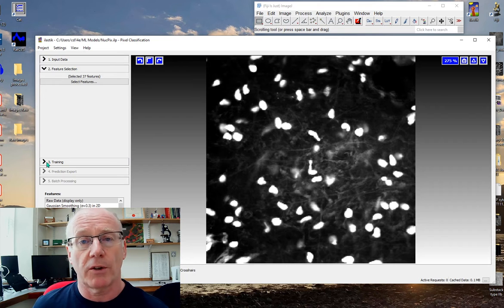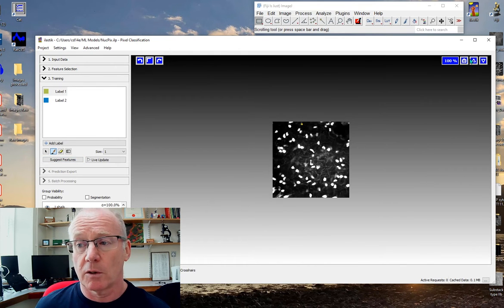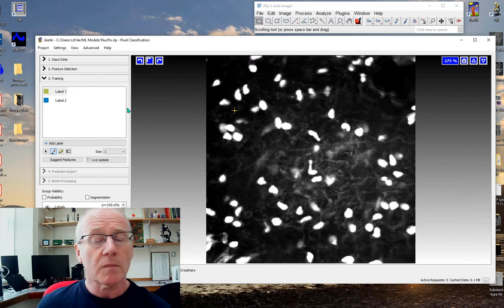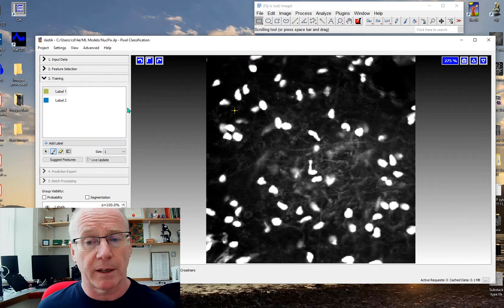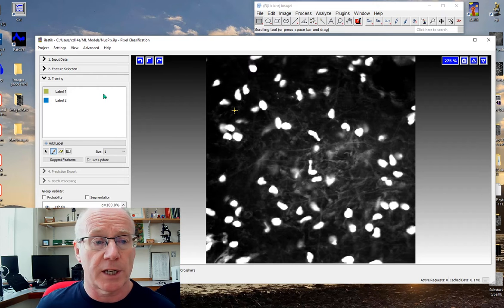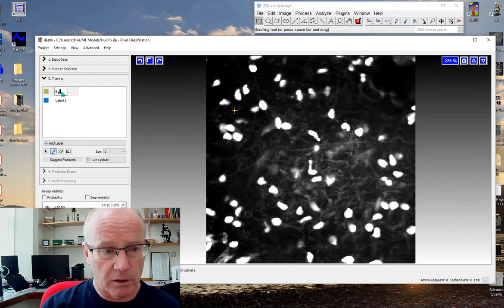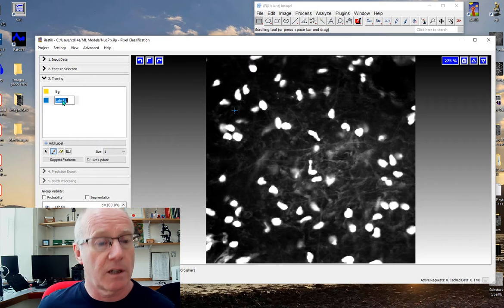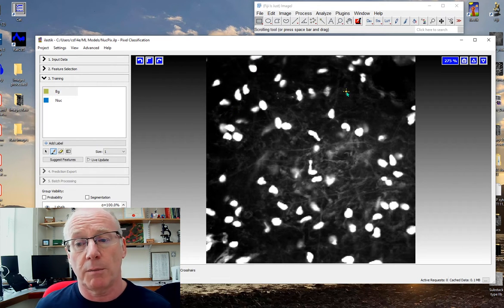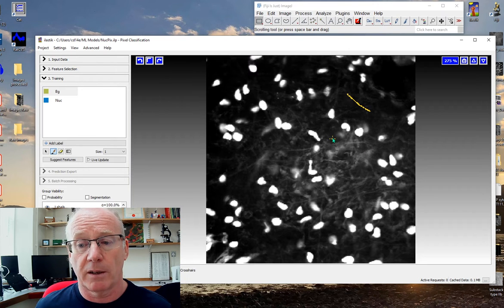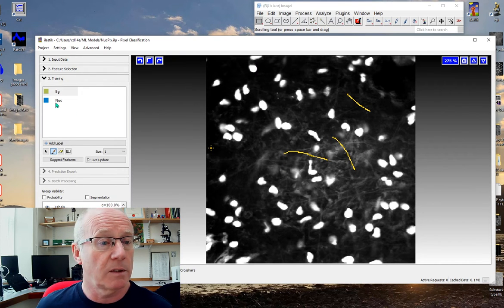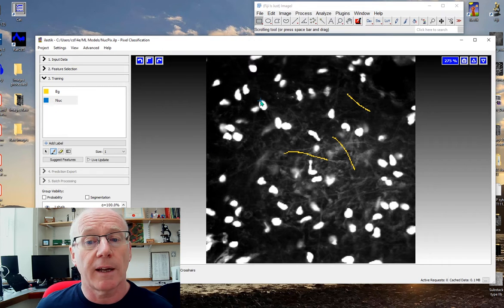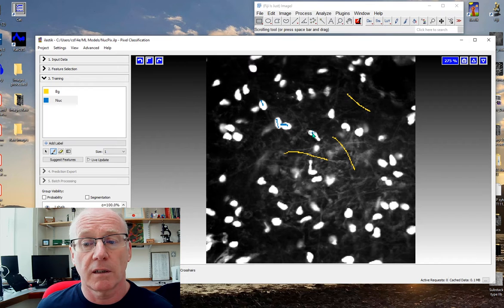We need to train our network and this is simply a matter of labeling what's background and what's the object we're interested in. Let's call this color our background and this color our nuclei, and we simply just paint on the image. That's background, these are nuclei.